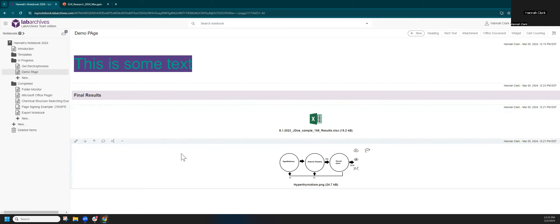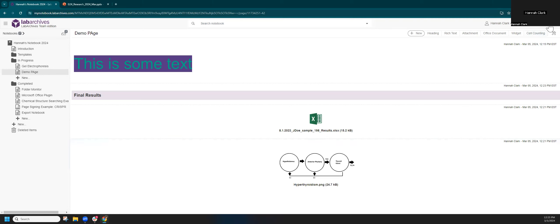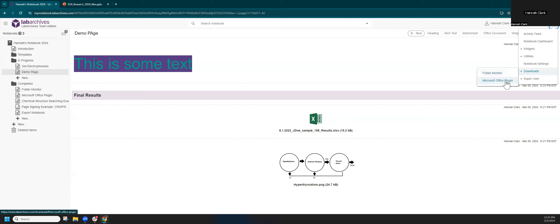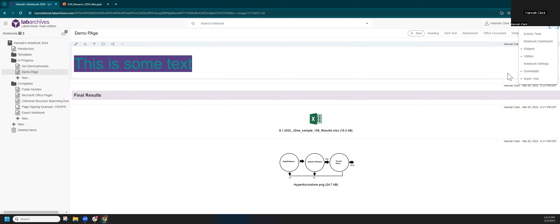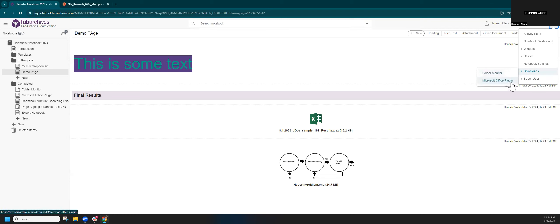When you have a lot of attachments to bring in, check out our downloaded tools on the downloads page: Folder Monitor and the Microsoft Office Plugin. Folder Monitor lets you set up a rule so all files in a folder on your computer automatically upload to a specified location in Lab Archives — a great way to bring in large numbers of files quickly. The Office Plugin lets you work in the desktop version of Microsoft Office and save files directly to Lab Archives without even having your browser open, with full revision history.